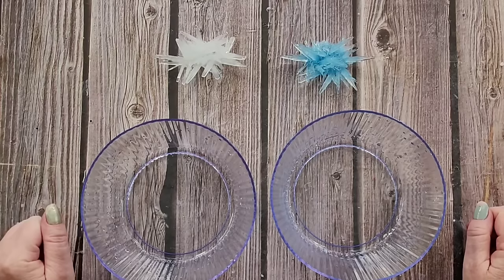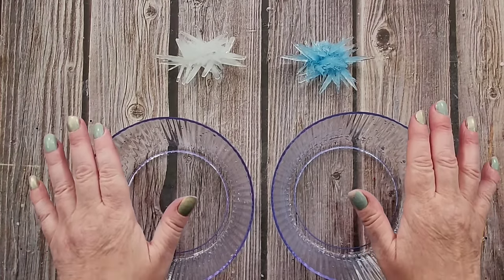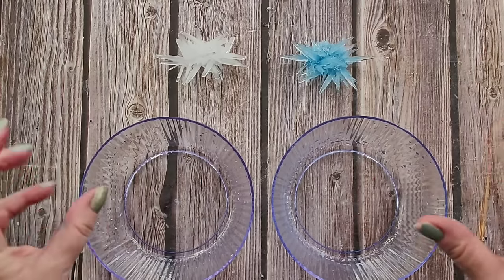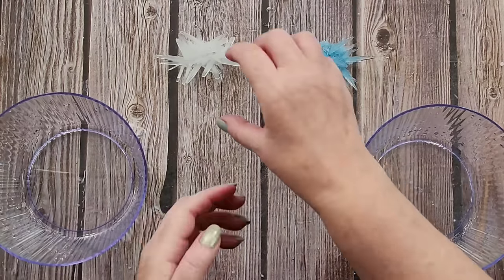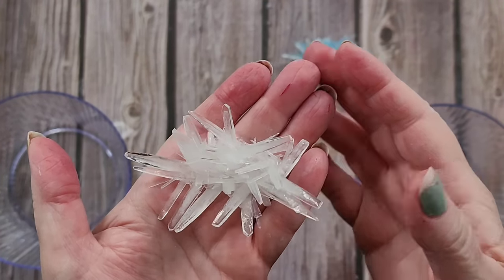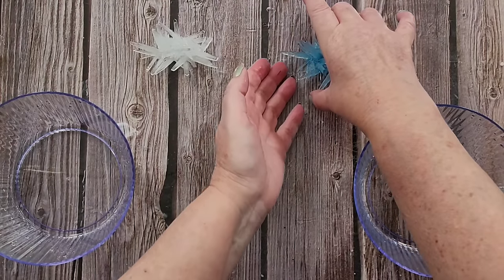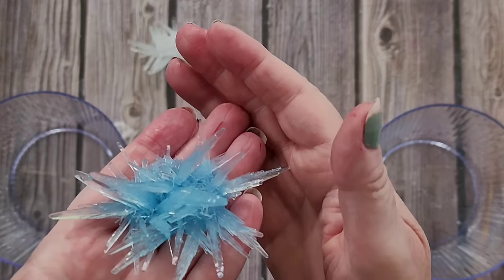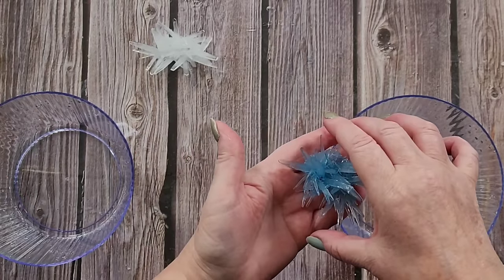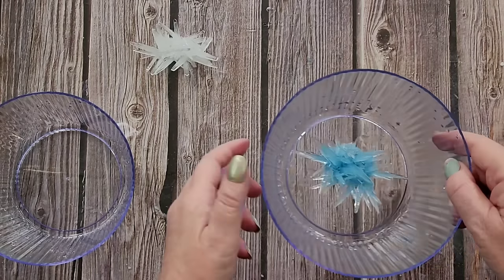G'day guys, welcome back to Pouring Your Heart Out. This is a carry-on video from the last two ADP crystals I made with a little bit of alum powder in them to make them grow spikier. This is where we left off — there's the white one and the blue one. They grow very similar; they each had their own little container.